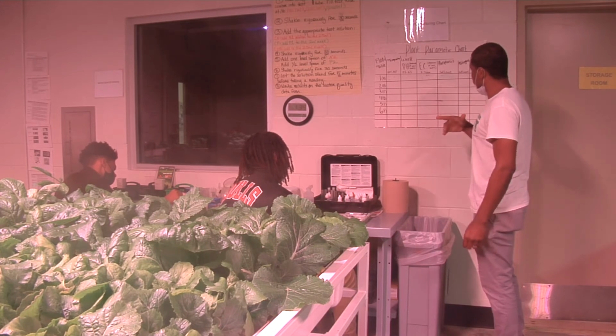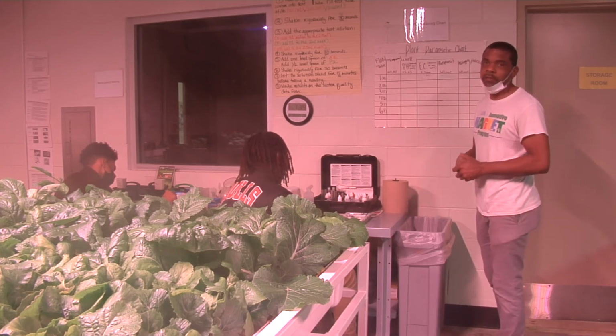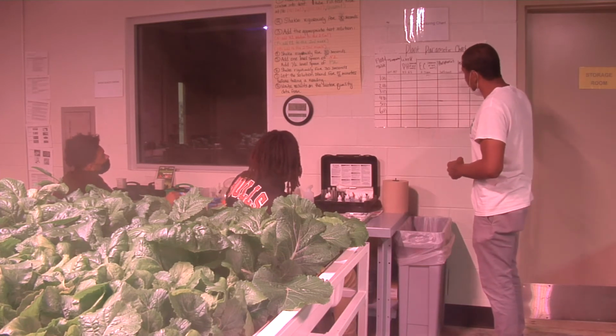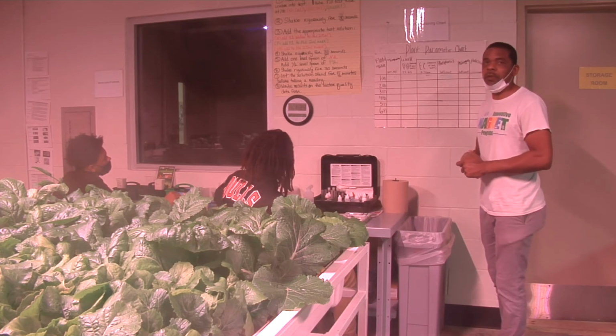They're also going to test for phosphorus, nitrogen, and potassium. The students learn about the 6 essential nutrients for plants, and these are the top 3 that we're going to focus on for today. So the students are about to conduct water quality tests.